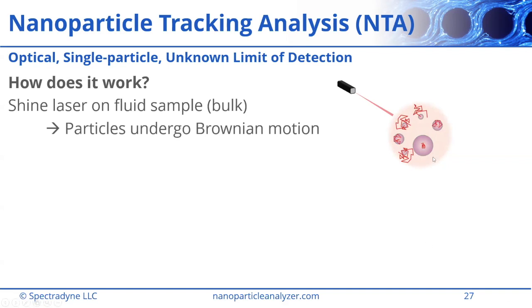And Mr. Miyaoka-san had a very nice illustration of this same idea. So particles are doing random walks around in the solution, and small particles make larger excursions, and large particles stay more still. They undergo less visible Brownian motion, right?